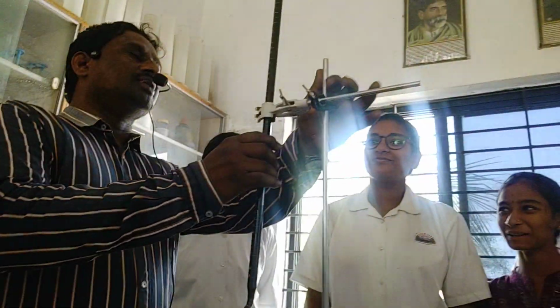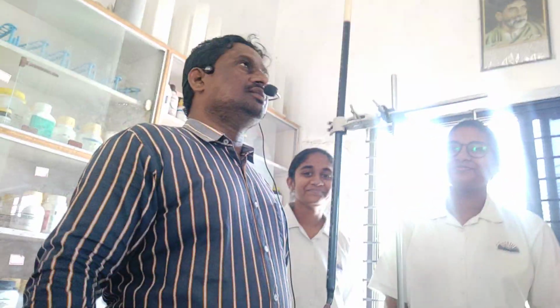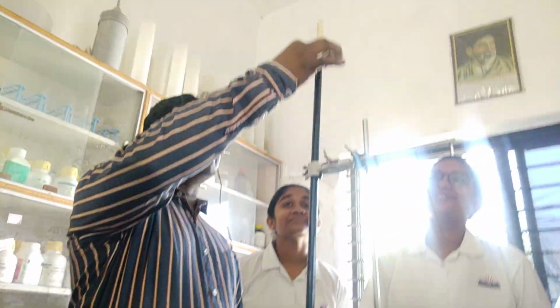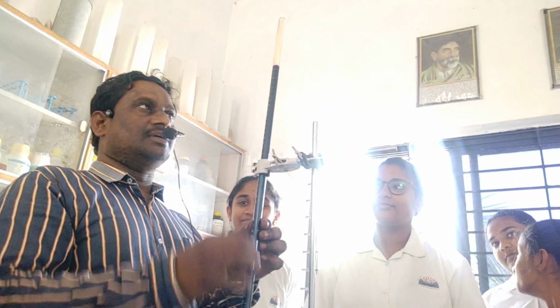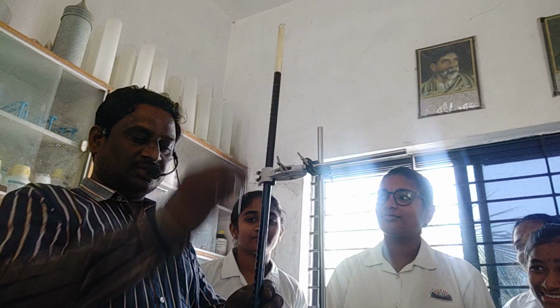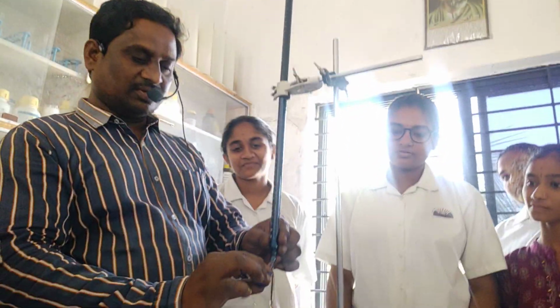So today we are going to perform the titration experiment. Okay? So what we call this one as burette. Burette we'll call. So this is burette, children. And what we call this one as stopcock. Stopcock.